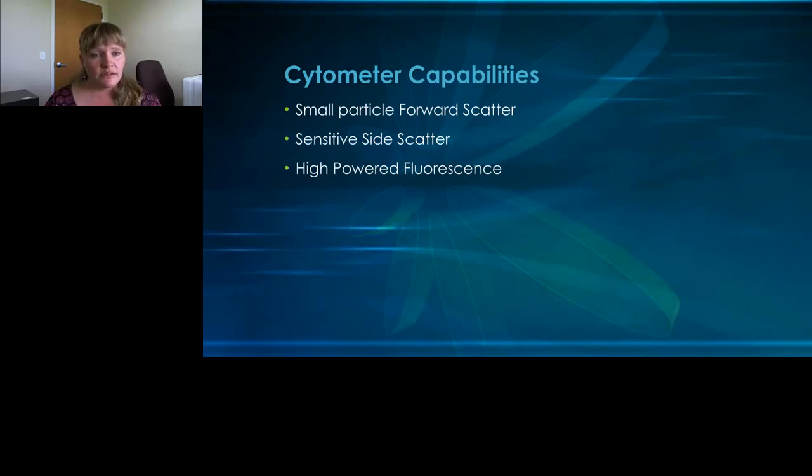So our flow cytometer, when you look at it, we have to make sure that it has very sensitive side scatter and very sensitive fluorescence detection. On the system, this slide shows are similar. For those of us that run flow cytometers, we're very comfortable understanding what 8-peak beads are. This is an 8-peak bead with FITC and PE. Now that's usually measured to measure MESF values, but our overwhelming question always is, do you really know how many fluorescein molecules are on your EV?